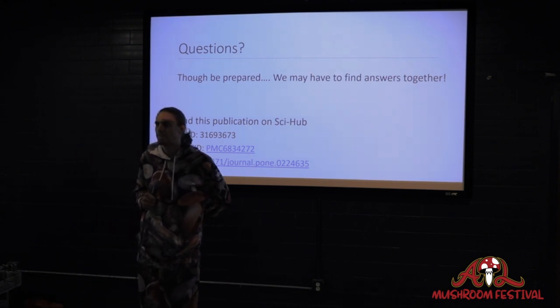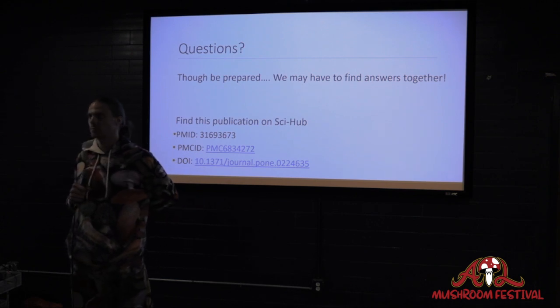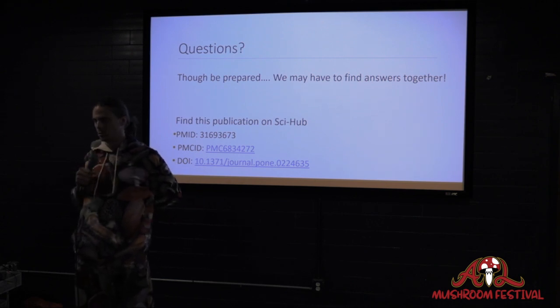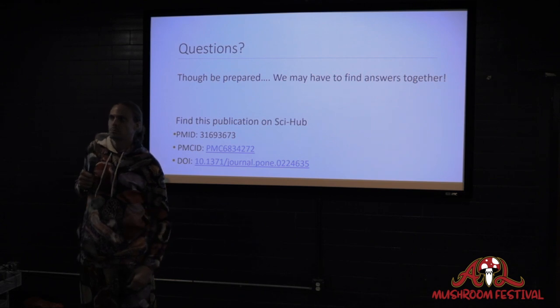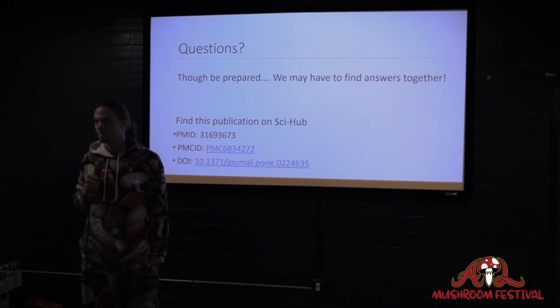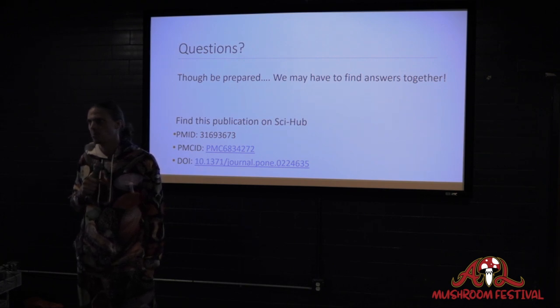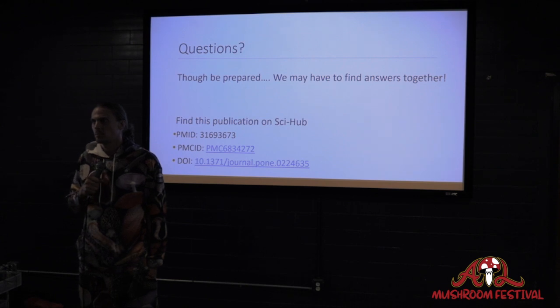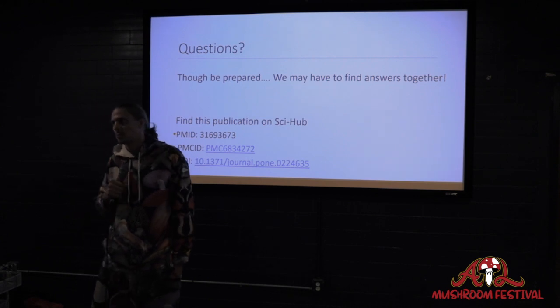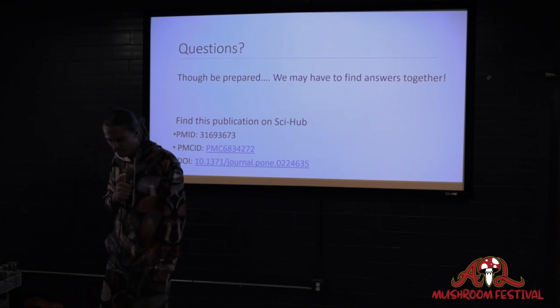Okay, cool. Last one. Once we have performed the technique correctly, the basic assumption, assuming we did it correctly, is that we are only worried about fungal contaminants at this point. We have successfully isolated the bacteria. Does that change, or are there any optimal colors of homemade agar you would use, given that you are no longer looking visually to see bacteria, exclusively trying to identify fungal contaminants?